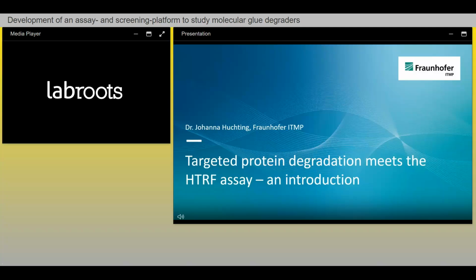The webinar today is focusing on the HTRF assay for the target RBM39 in the context of targeted protein degradation. And we will show you how we use the HTRF assay in our TPD projects. For that reason, I will first give a brief introduction on targeted protein degradation and the assay technology.